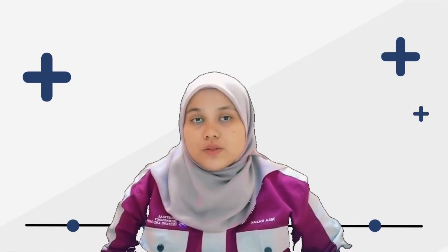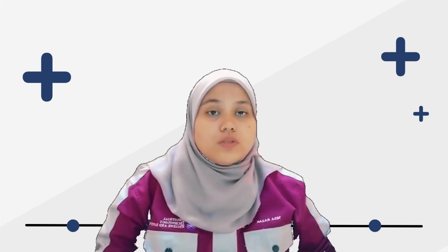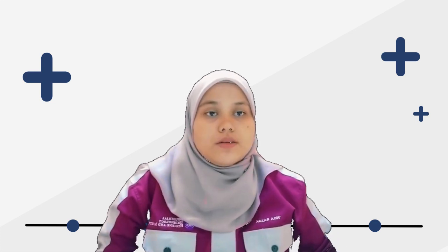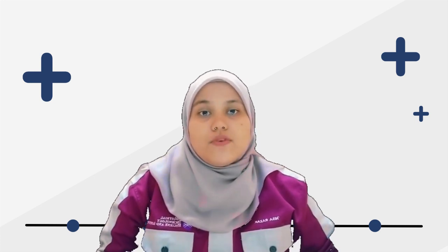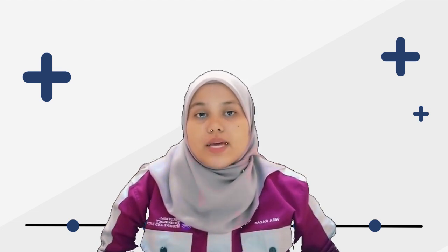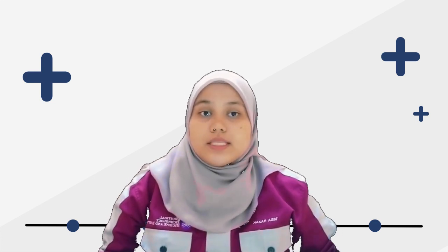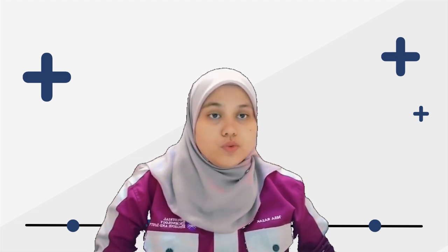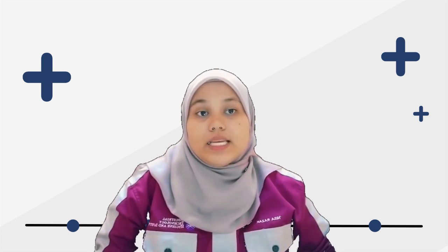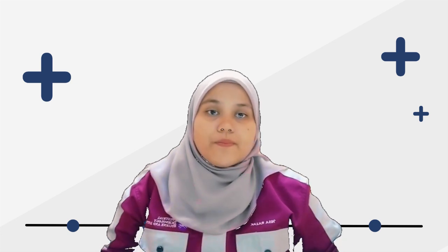During the assessment, we chose 3 chemicals, consisting of one mixture and 2 substances, to be analyzed. These chemicals are hexane, m-phenylenediamine, and gallic acid. From the assessment conducted, we can say that the chemicals used in this workplace are rated as Action Priority 2, AP2, where the risk rating (RR) is less than 15, which indicates the work unit is exposed to a moderate risk level from the chemicals.